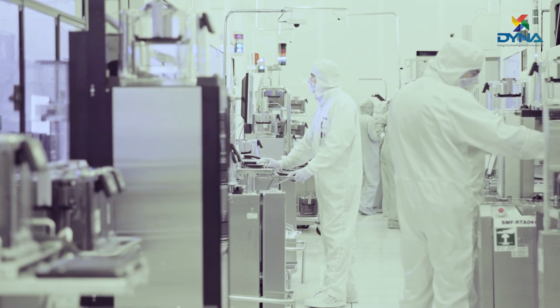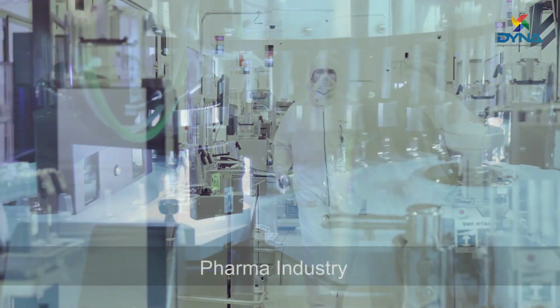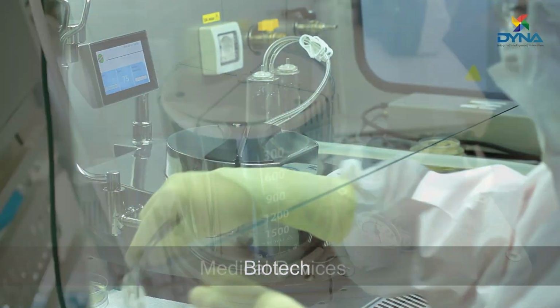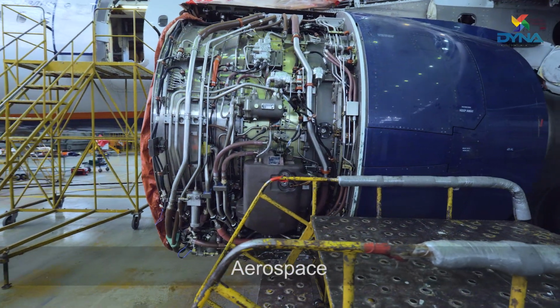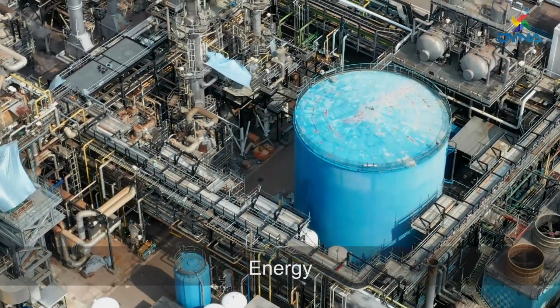They are used extensively in industries such as semiconductor manufacturing, pharmaceuticals, biotech, medical device and life sciences, as well as critical process manufacturing common in aerospace, optics, and Department of Energy.